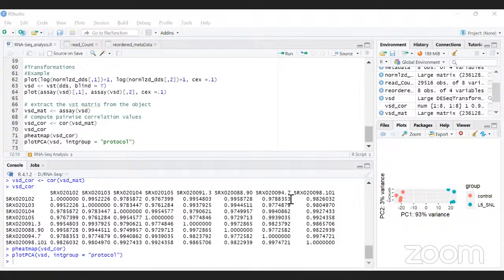Maybe we can give a small introduction to what you are going to present for the next session. I will be talking about differential analysis per se, like how DESeq handles it. There might be a lot of false positives and everything, right? What statistically DESeq does. If people are interested in the statistical viewpoint, I could take that.